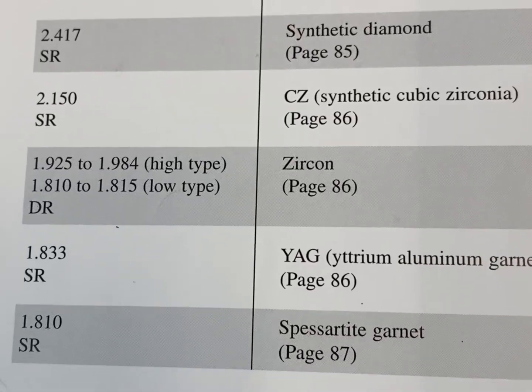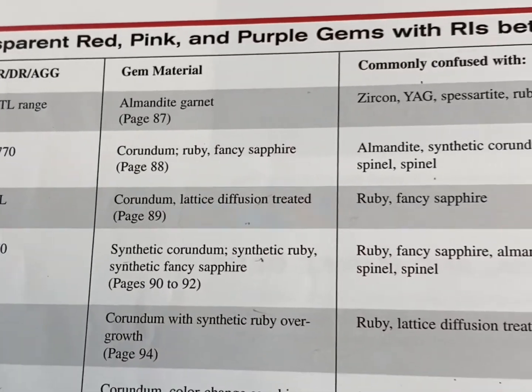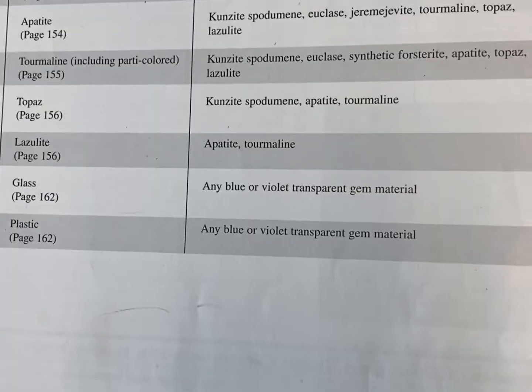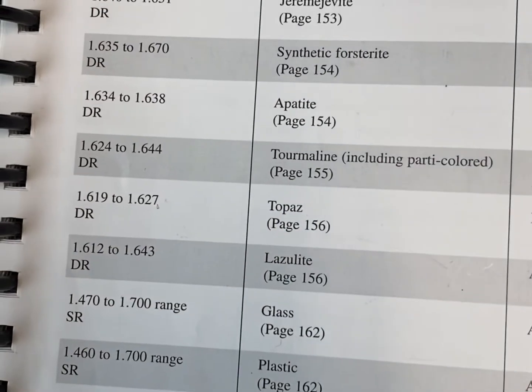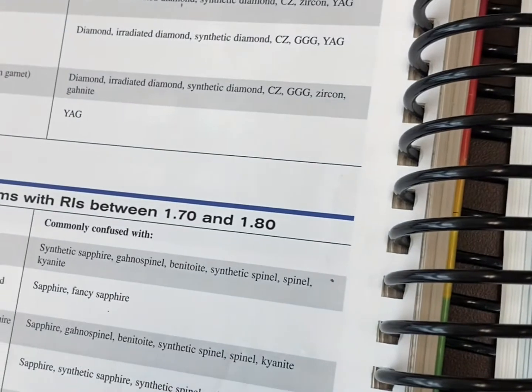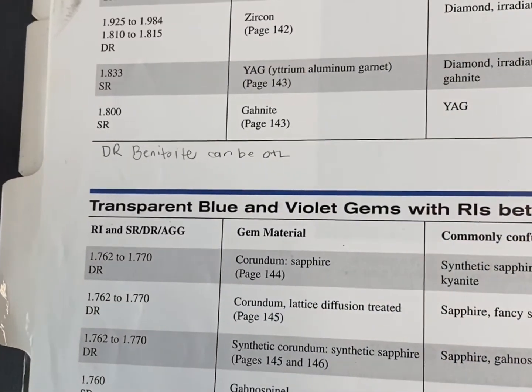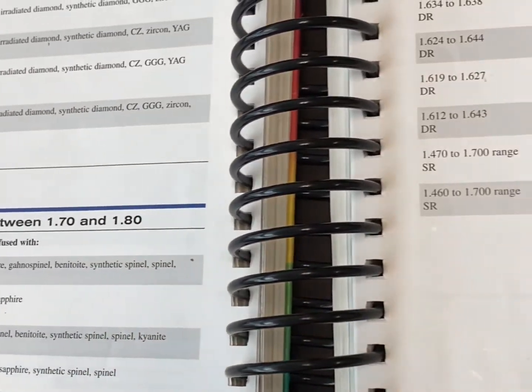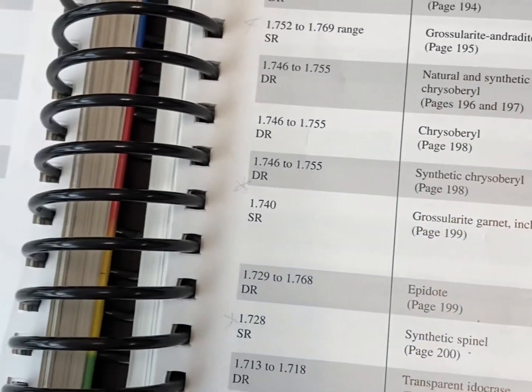As I mentioned earlier, each gemstone material is going to have their own unique range or reading on the refractometer, and the best resource for this information is the GIA gem lab manual. There are gemstones that will have similar readings, so it's important to know the other key tests that you'll need to perform to properly identify the material. Testing does not stop with the refractometer — it is a primary step that gemologists use to guide them in the right direction.